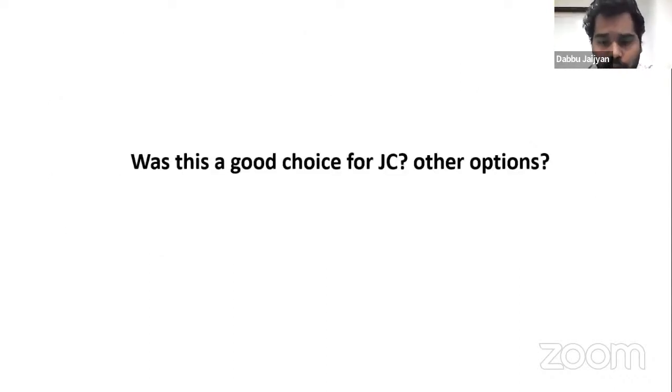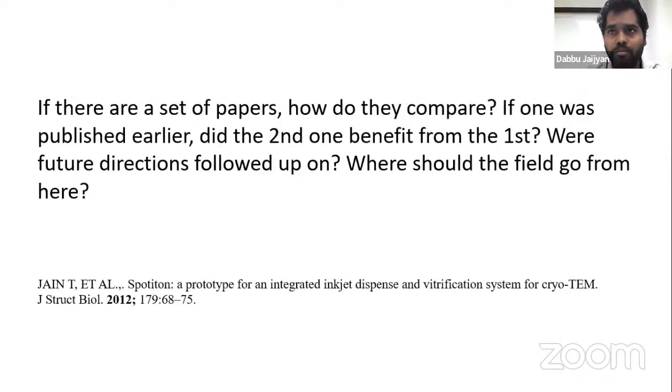So is this a good choice for the journal club? I would suggest yes, because of this revolutionary technology, we are now able to prepare vitrified grids in an automated machine, which is highly reproducible and highly symmetrical, and which we can easily perform with minimal interference. The principle was developed 25 years ago and it remains the same, but the technology has advanced and revolutionized the field of structural biology. This is what I would suggest.